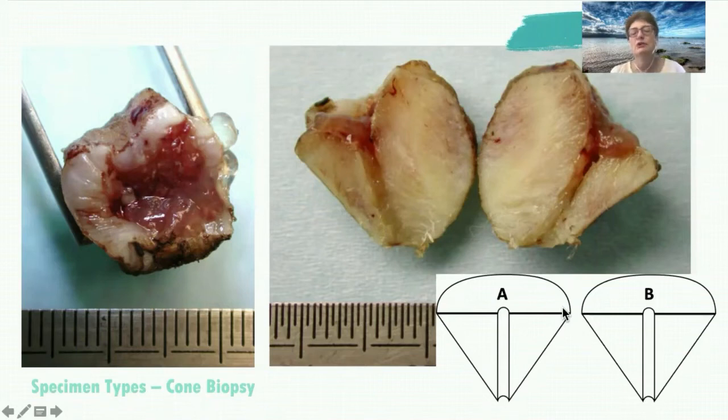So these are used where a large amount of tissue has to be removed, such as invasive cancers or adenocarcinoma in situ. And they can cause problems in later pregnancies because it means that the cervix has difficulty maintaining competence in later pregnancy. Let's think now about the microscopy of the cervix. First the normal cervix and then the abnormal cervix.